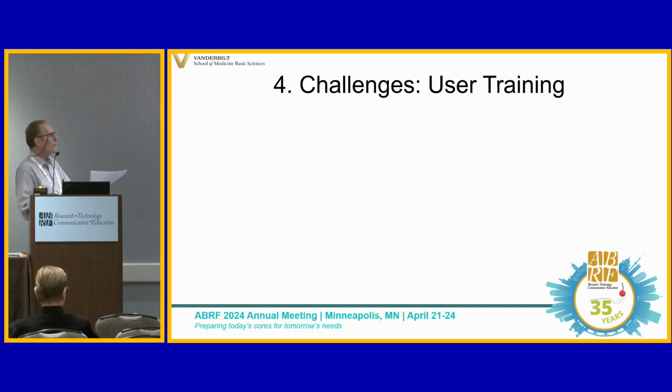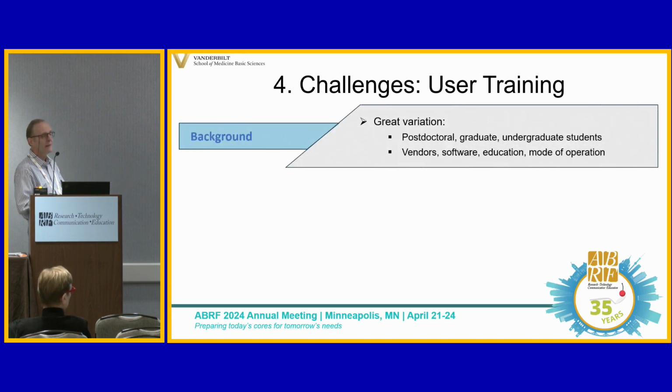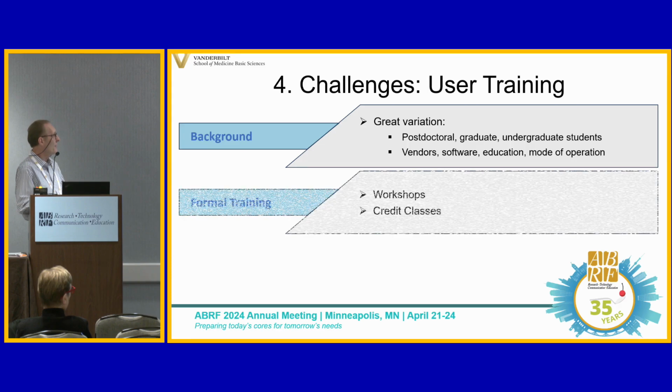in the method, but we also have some challenges that we need to deal with. We had a whole session yesterday afternoon about training, and it resonated greatly with me because some of the things that were discussed yesterday are actually very true in our facility too. We have students that come with completely different backgrounds. We have postdocs, graduate students, undergrads. They obviously are in a completely different state of education and have different knowledge. Then on top of that, we have people that have worked with different vendors, different machines. So they use different software. They came out of different labs that had different modes of operations. So there is a whole range of different backgrounds that we have to deal with.